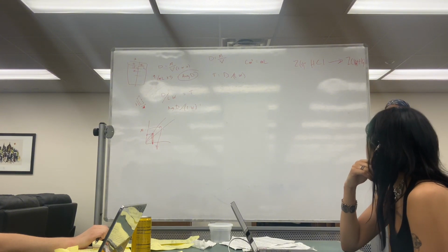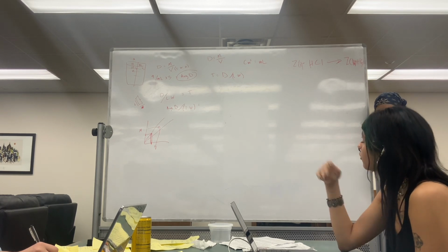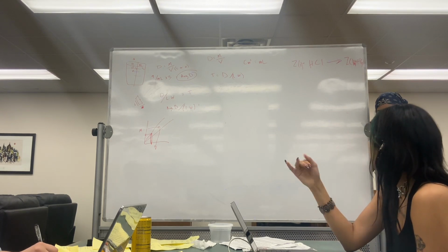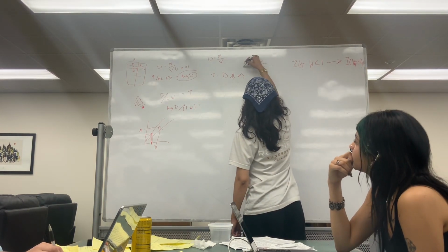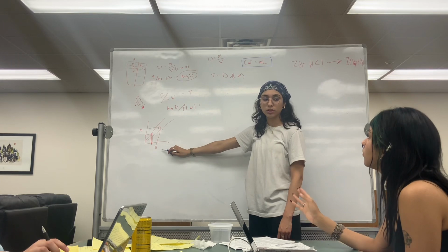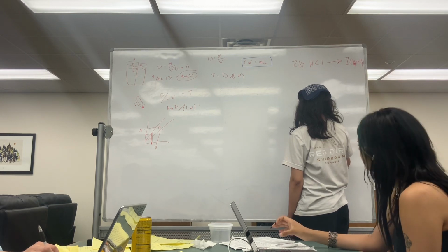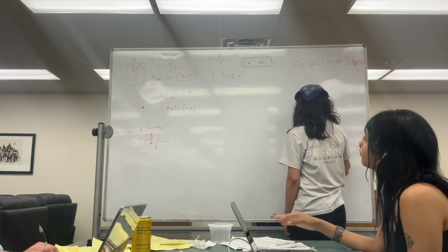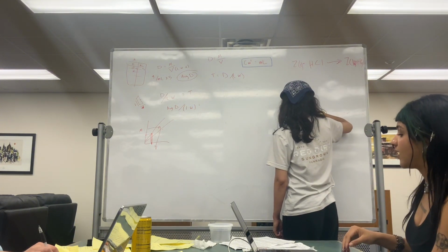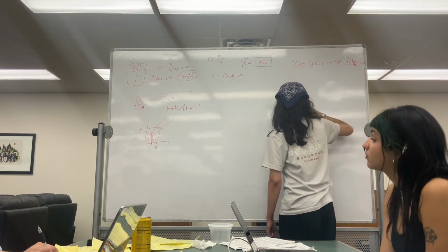Don't forget that because you're measuring your aluminum sheet in centimeters, but your chart's probably gonna give you the volume in milliliters. Just remember that 1 cm3 is 1 milliliter. It's direct. Your chart will probably give you the volume in milliliters, but you're gonna be measuring your aluminum piece with a ruler. Your density is gonna be grams over milliliters, so you can replace that with grams over centimeters cubed, and it's a direct equivalence. Okay, I got you.